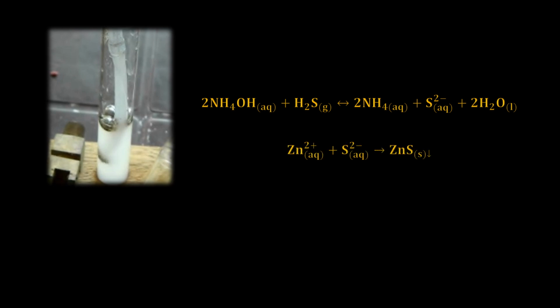After the group 3 elements were separated, there will be some ammonium hydroxide and ammonium chloride left in solution. By passing hydrogen sulfide gas through the filtrate, the sulfide ion increases in concentration and additional water is produced. The ammonium hydroxide dissociates to form water, leaving the sulfide ion free to combine with the elements that will precipitate, leaving all others in solution. This is evident when referring to the solubility of common compounds in water table. Therefore, zinc, for example, will combine with the sulfide ion to form zinc sulfide and will precipitate as a solid.